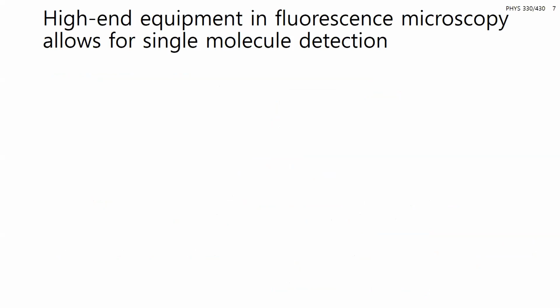So how can we detect single molecules based on fluorescence? We discussed the components of optical microscopes in the last lecture, and we'll go over what those components are. But the main thing is, first, why fluorescence instead of, like I just mentioned, absorbance, scattering, refraction, those types of diffraction and the like.